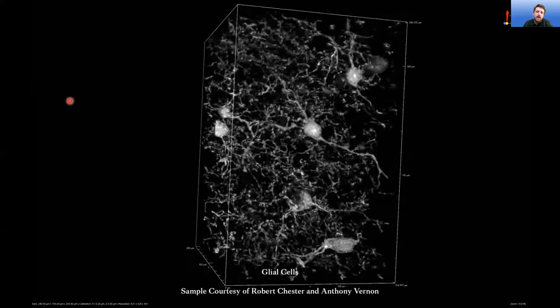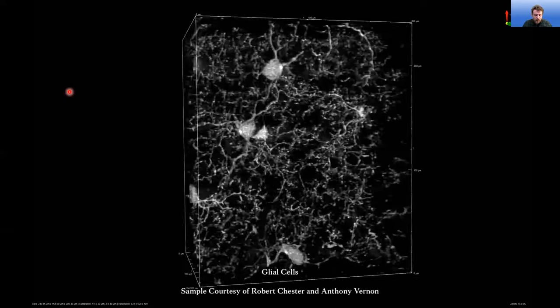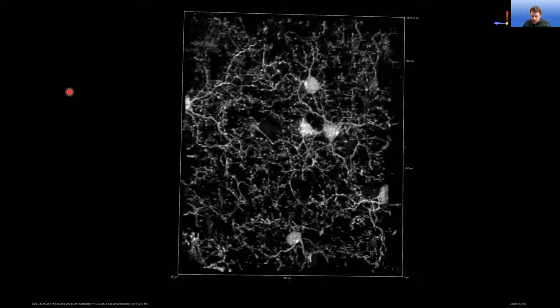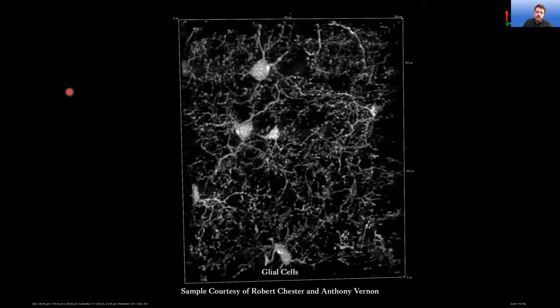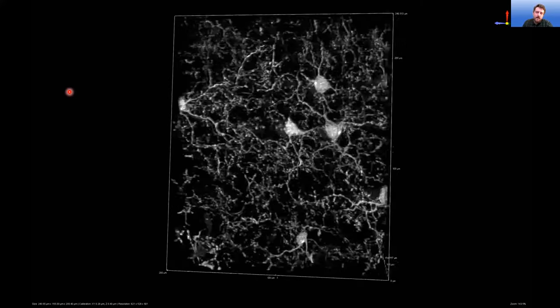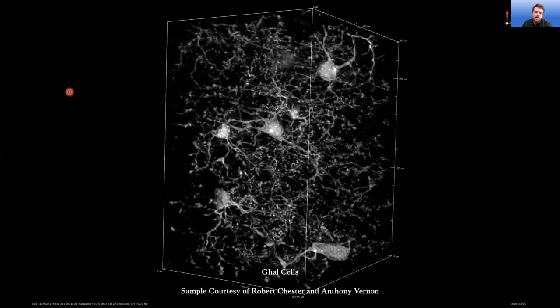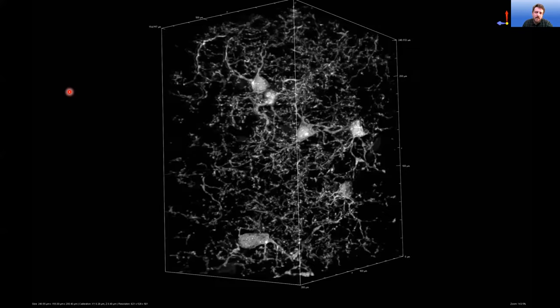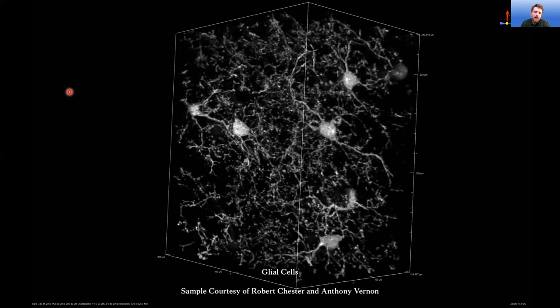The other thing as well, sample preparation techniques. I know from what I've seen with what people have done, sometimes when you mount for a slide, it might compress some of this into a sort of flattened version of what it is. And that's something that's worth really considering, is how is my sample preparation affecting what I'm actually looking at?